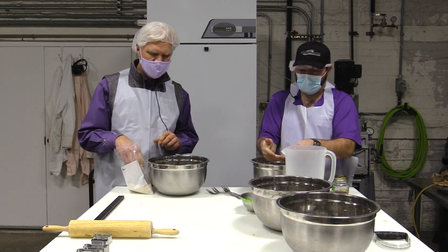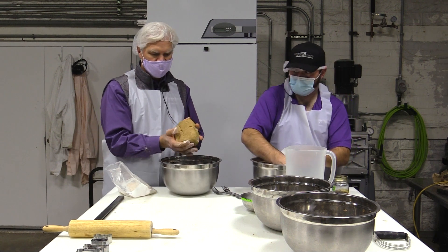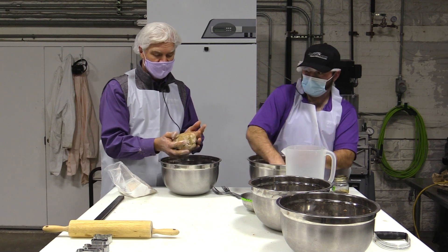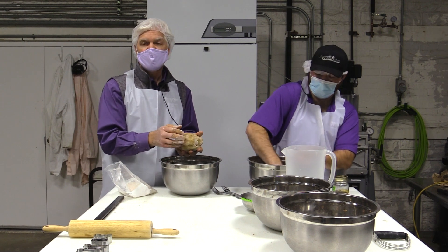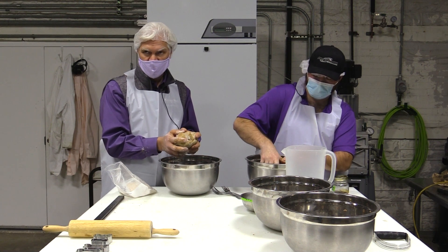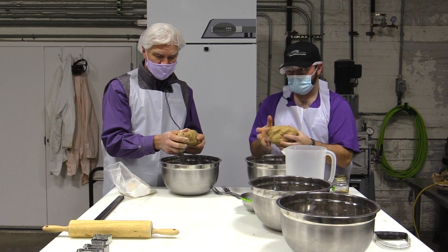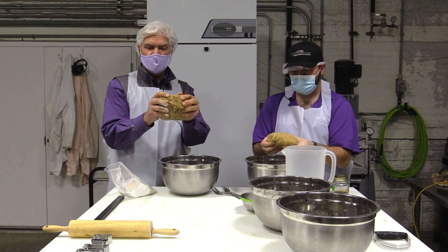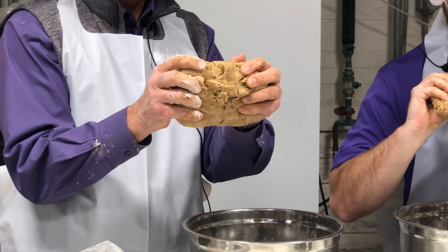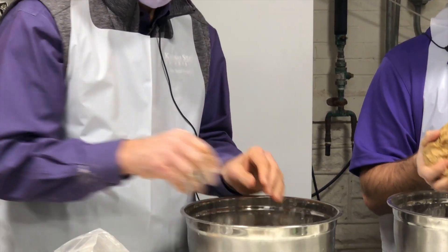We've got everything mixed in, and you can see this wheat control dough has a nice firm ball. We've added a little more water since we're making a sheeted product, so it forms a nice resilient dough. You can see the viscoelastic properties — as I pull it apart it resists, and as I take my hands away it relaxes back. That's the property that gluten is bringing to the equation.